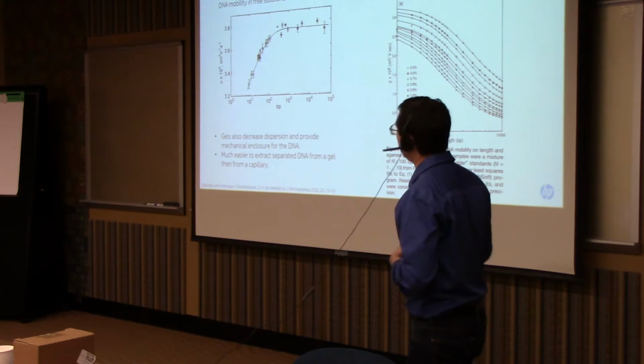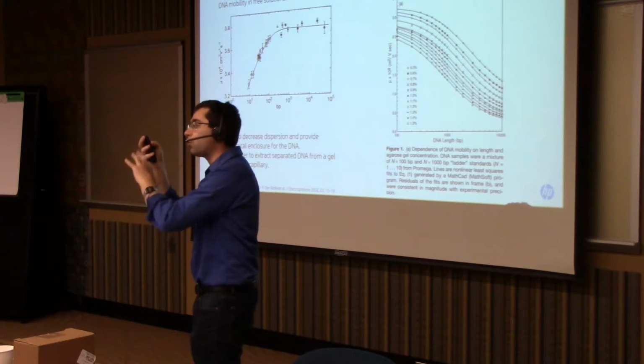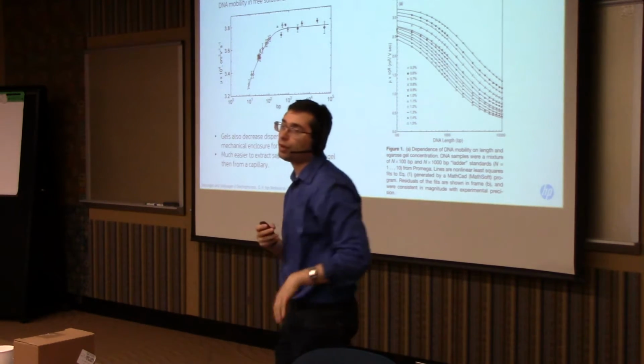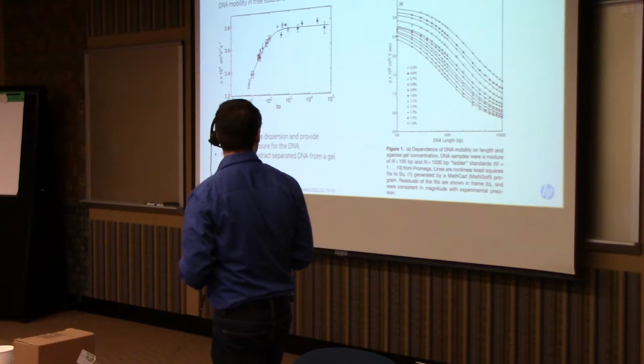So by tuning how dense this kind of forest is that the DNA is trying to find its way through, you can tune this property. Okay?